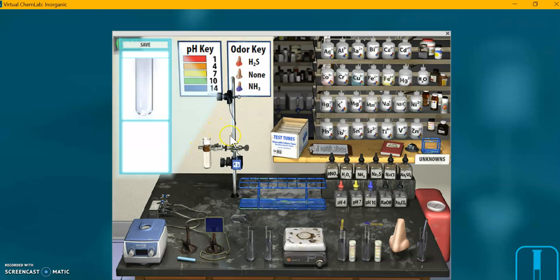So it says to click on, meaning put into the test tube, the ion. So I'll click on the barium and it automatically appears in there. Strontium, calcium, magnesium. Where is that? There we go. So now we have all of them.